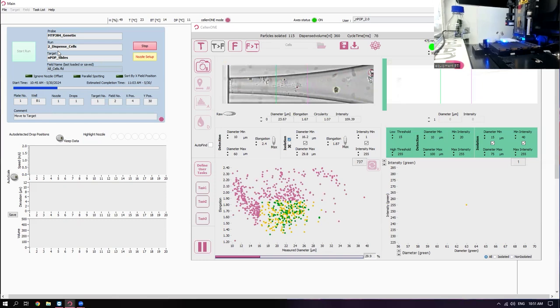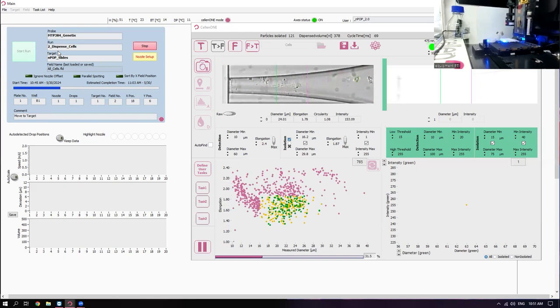And what it does is, it just really allows us to, let's see here, DMSO, water. Which is, I think, why we do our cryopreservation, right? It doesn't actually become... Right, they don't actually connect these lines anywhere, right? So you have your freezing point of pure DMSO there, freezing point of water there.